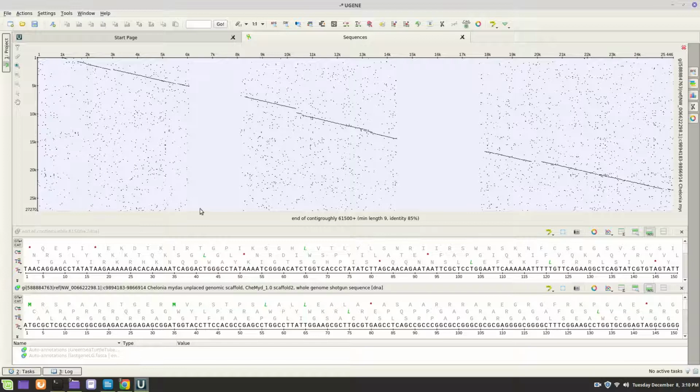All right, now these gaps here are where the ends are. There are some unknown pieces. These breaks are essentially where we're going to find... Actually, this looks like genomic sequence. Maybe that's why I should go find that original, because this is genomic. Now, how do I know this is genomic? The introns would be very large. We should see larger gaps here.